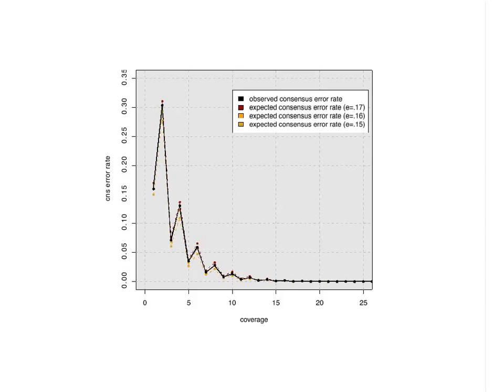The other main takeaway is it's a question of what you are after. The same as in the eukaryotic genome, we saw if you're after the exons, the Illumina data at high depth works great. And it's the same thing here in the single cell. If you're after the general genes of the genome but don't care too much about the full structure or the repeats within it, the high-depth Illumina sequencing will beat the PacBio because you just can't get enough depth of the PacBio sequencing to get around the MDA bias that you have.